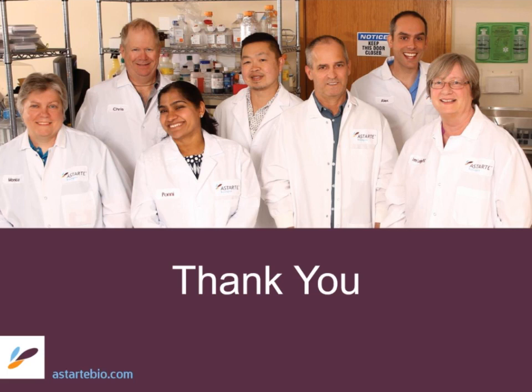Yeah, you can see it by flow, and you can label your effector cells and just gate them right out. You have no doubt that you have death in your target, and at least when I've run it, you don't see death in the effector cell population. So yeah. And hey, if you want to move to something that doesn't tie up the flow cytometer, you can always do that preliminary experiment to show that that's what's happening, and then expand out to something more. Yeah, that's a good point.